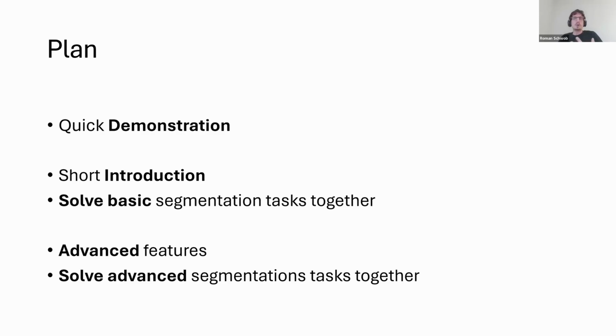While it's probably mostly going to be me talking, I would still like to encourage you, if there are some very important questions, please go ahead and ask them in the chat. I hope that I will see them in time, but I'll try to check from time to time so that everybody gets along with what I'm saying.